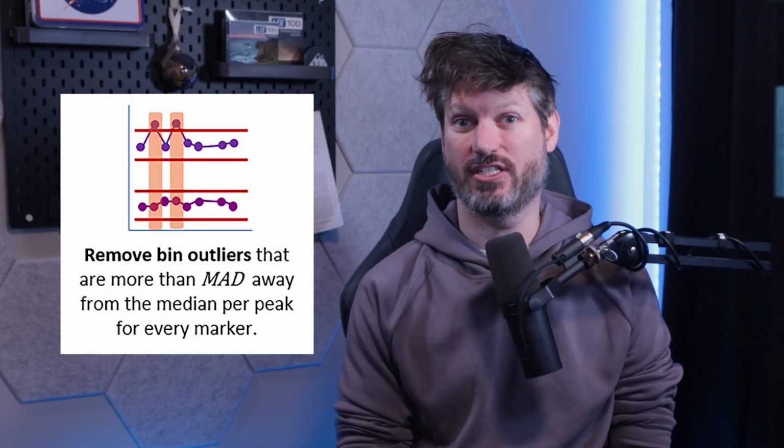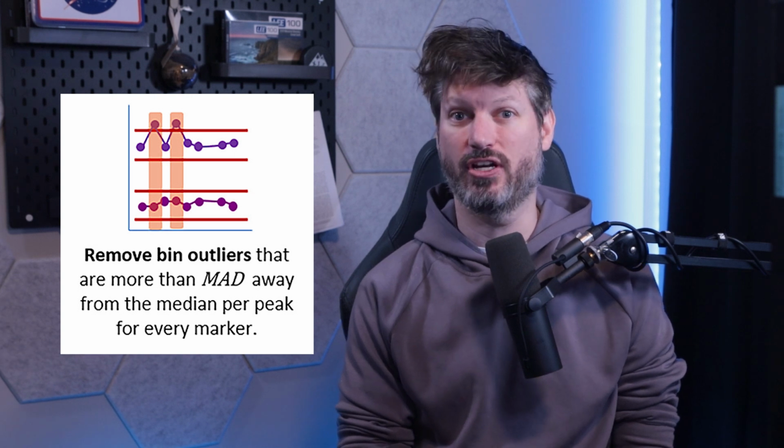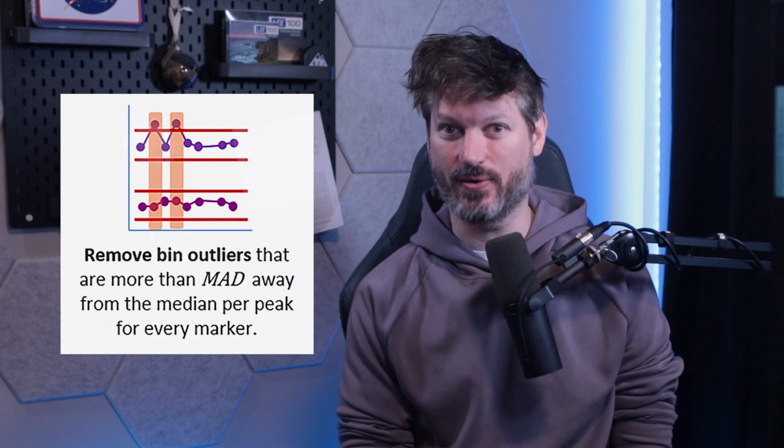The second step is a median absolute deviation distance. For more subtle changes that might not be picked up by the isolation tree, PeacoQC looks at each marker individually. It smooths the peak values over time and then calculates how far each bin's smoothed peak value is from the median of all the other smoothed values for that marker. If a bin's peak value deviates too much, by default it's set to 6 median absolute deviations, it's flagged as low quality. This helps catch issues where only a specific marker is affected.